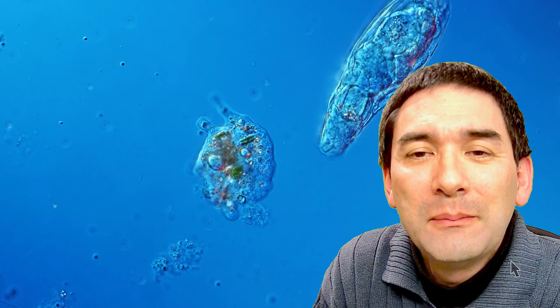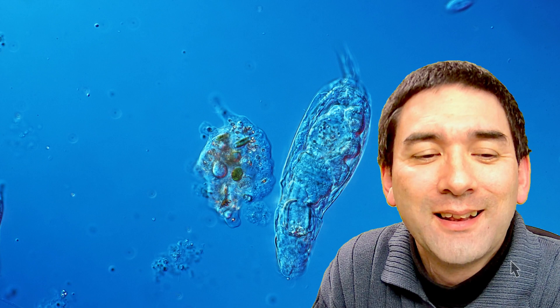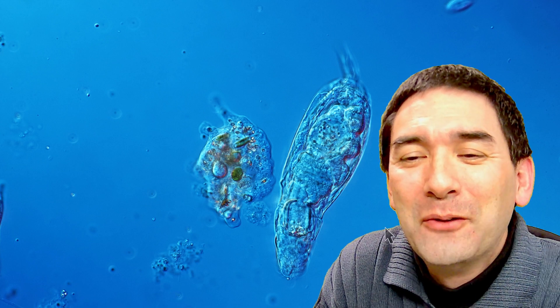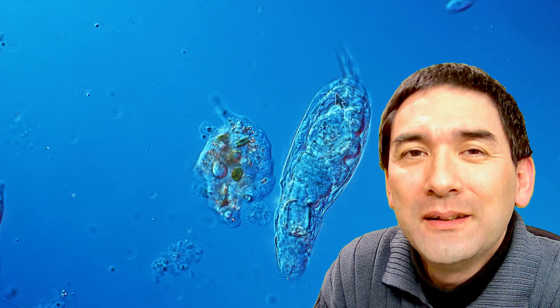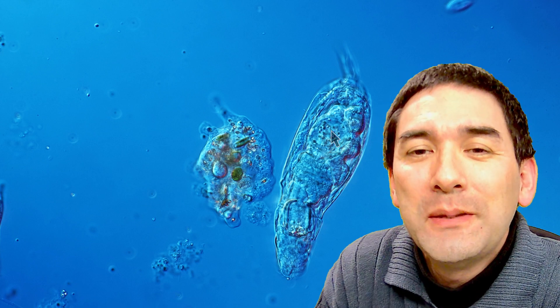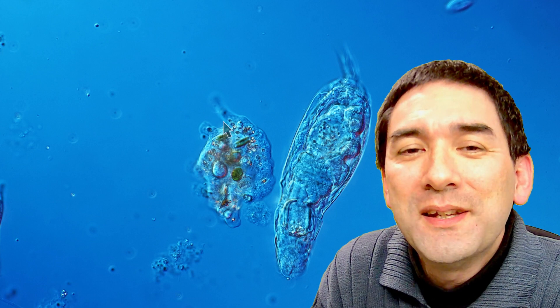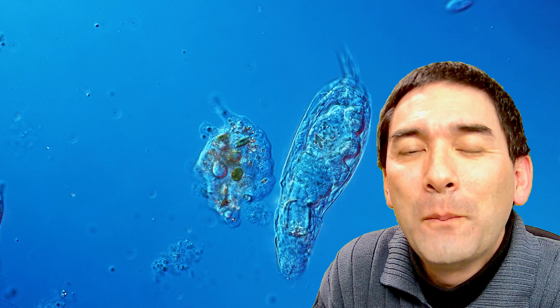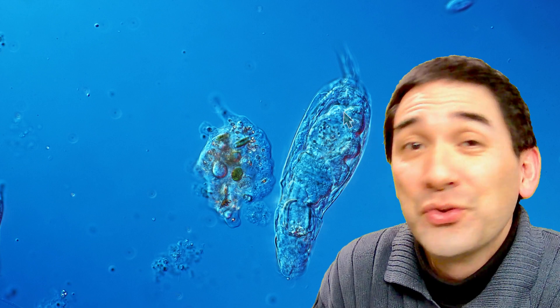Let me go reverse a little bit because what we see here, this gigantic little thing, this gigantic little organism over here is actually a rotifer. It's a multicellular animal, a so-called micro animal. It's made of many cells and the amoeba over here is actually one cell. So you just see simply by comparing the size that this rotifer which maybe contains a thousand cells.